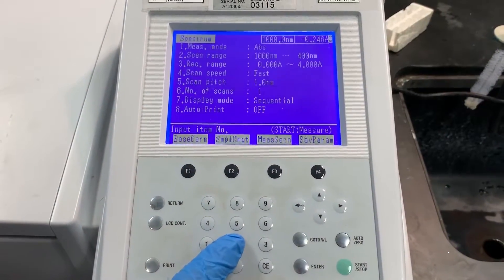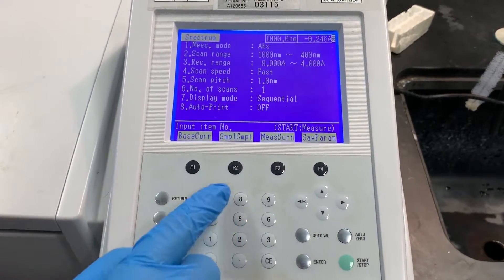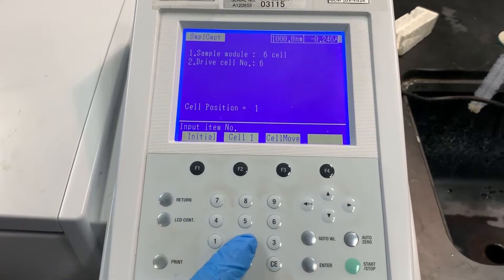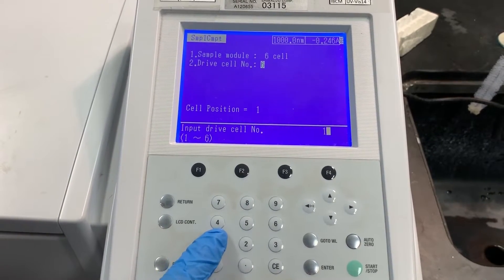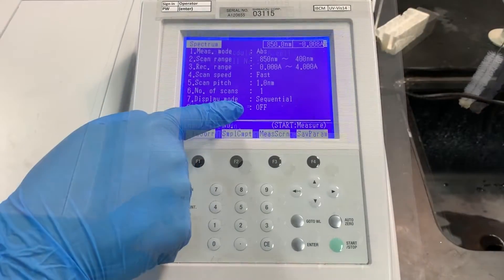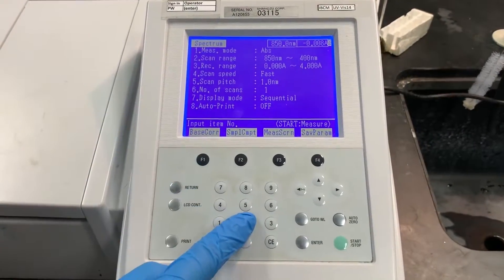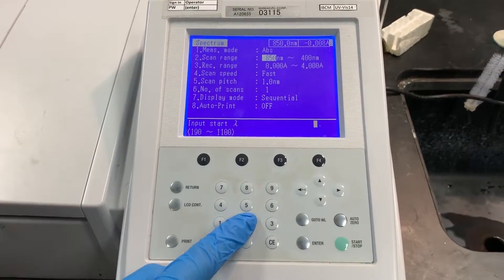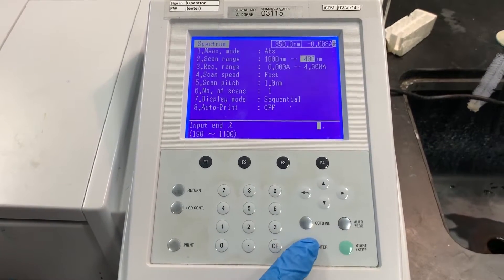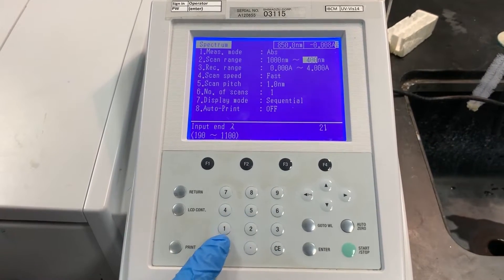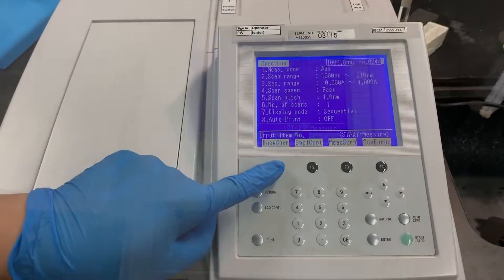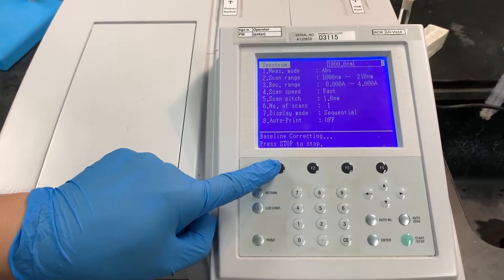Then select spectrum, sample compartment, drive cell number, and change the value to 1. Return to the spectrum page, select scan range, and adjust the wavelength range according to what the experiment requires. Now select baseline correction to calibrate the machine.